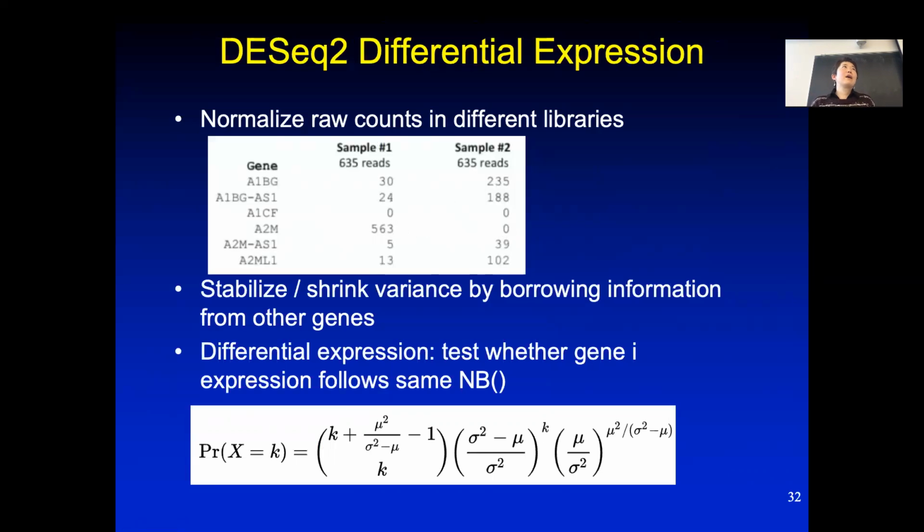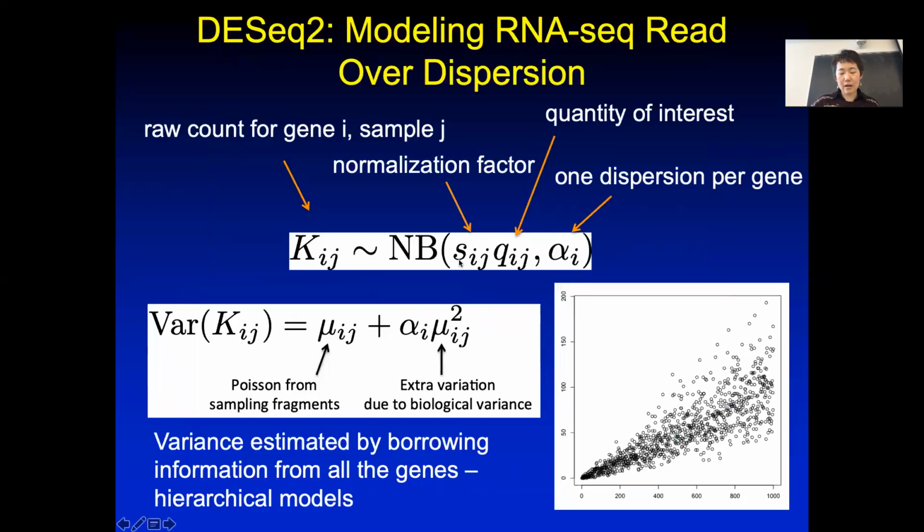So it's like, actually in the early microarray days, you can imagine if I take all the genes that didn't really have too much differential expression, they are fairly stable, and I calculate how many reads those are in the first sample and how many in the second sample. You realize that, for example, in the first sample, this crazy transcript is sucking up your reads, and the remaining really not changed genes didn't even have a chance. So you want to scale everybody a little bit, okay? And so they do a little bit of scaling factors in here.